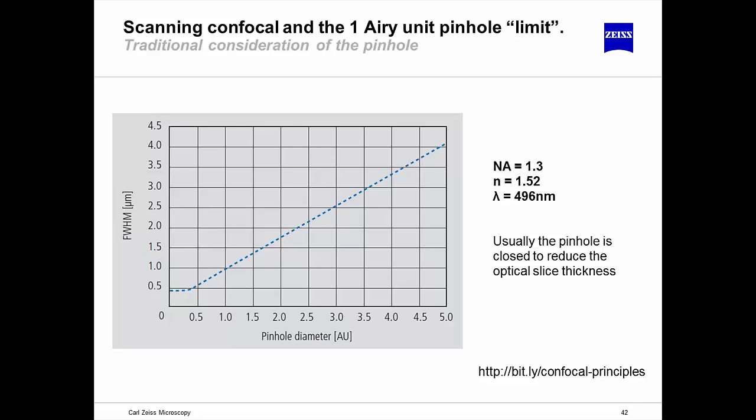The first slide I present is basically the full width half maximum in Z versus pinhole diameter. This is what most people associate a confocal with. What it simply shows you is with a big pinhole in X, you get a big section. And therefore, by closing down the pinhole, you narrow your optical section.